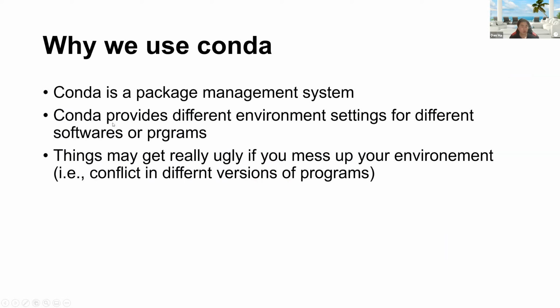And we already loaded up the Conda environment. Conda is a package management system. You can think of it as an app store on your mobile phone. It provides different environment settings for different pipelines or software, so it gets much easier to set up and install certain programs, especially in Linux.